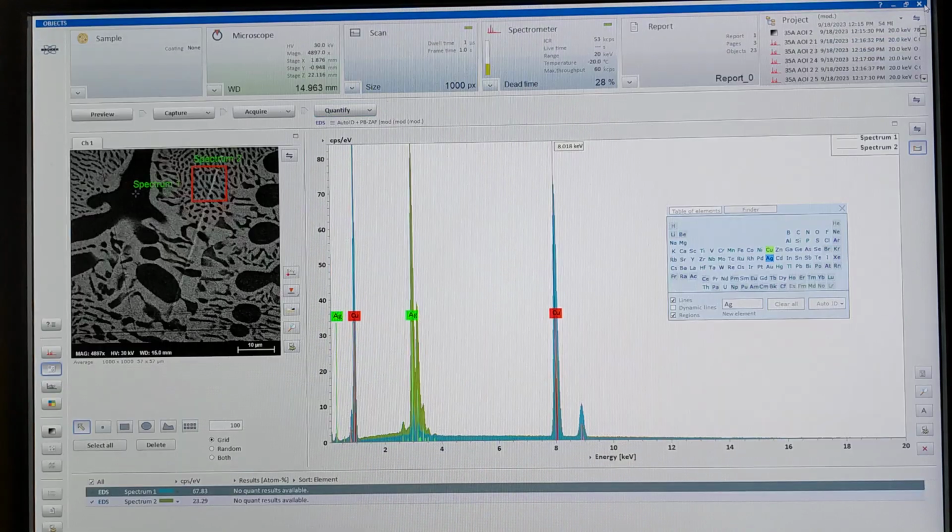All right, I'll close this window, and if you want, you see here we have the double back and forth arrows. We can add this image to the report, right? So we can tell people, here is where I scanned, and here's where the data is coming from.